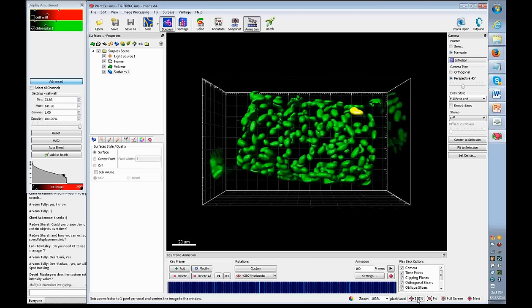You will have some information about the overall displacement of that track, but you won't have information about the instantaneous speed or the intensity or the volume, etc. at frames 11 and 12, or whatever they are if you uncheck this. It varies with the image, basically whether you expect the object to be detectable at the gaps, whether you would turn that on or not.